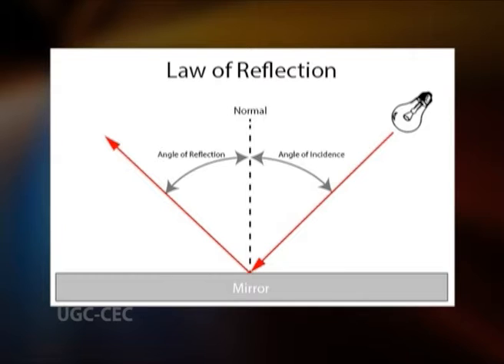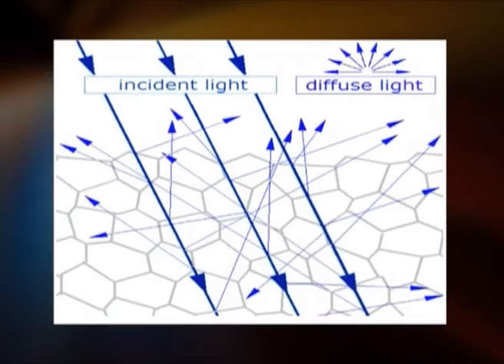Deviations from the law of reflection due to the irregularities on a surface are also usually considered to be a form of scattering. The scattering of light yields a number of valuable insights into the properties of macromolecules, including the molecular mass, dimensions, and diffusion coefficients, as well as association or dissociation properties and internal dynamics.